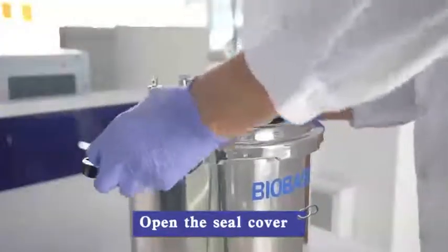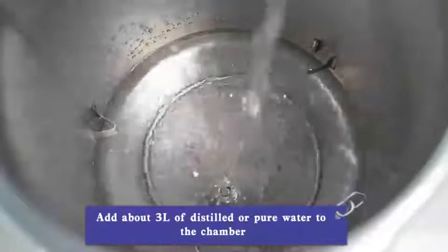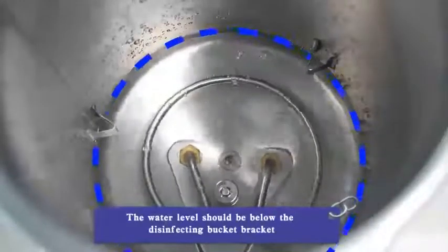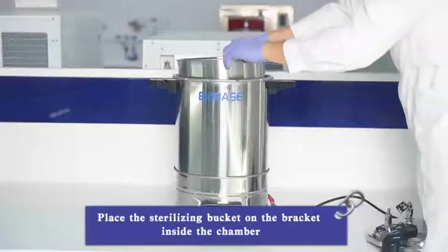Open the seal cover and take out the disinfection bucket. Add about 3 liters of distilled or pure water to the chamber. The water level should be below the disinfecting bucket bracket. Place the sterilizing bucket on the bracket inside the chamber.